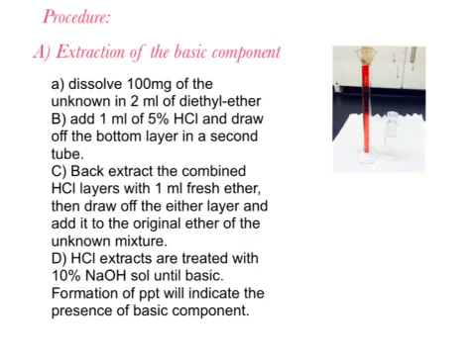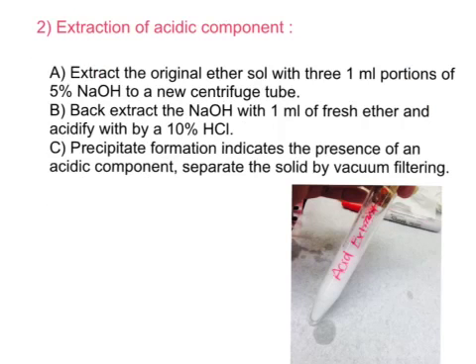The HCl extracts are treated with 10% sodium hydroxide solution until basic, tested by blue litmus paper. Then, if a precipitate forms, this means that there is a basic component in the mixture. The student then tested for the acidic component.